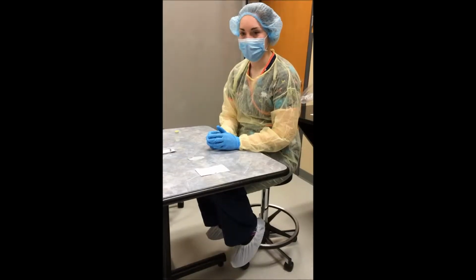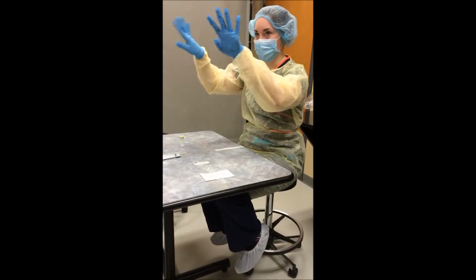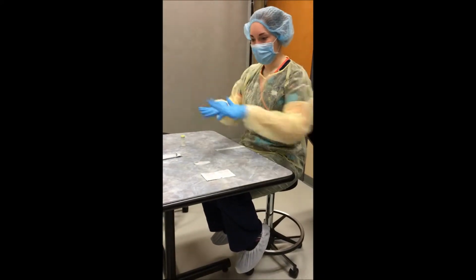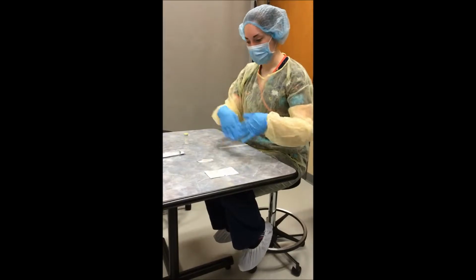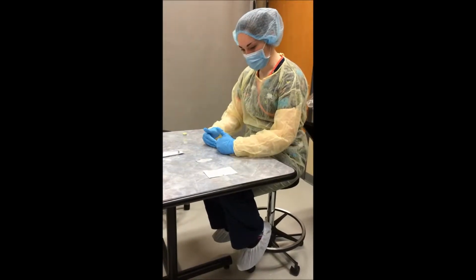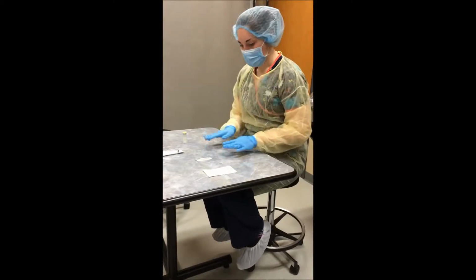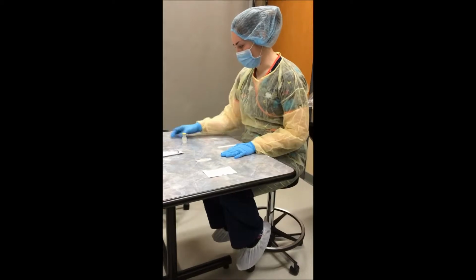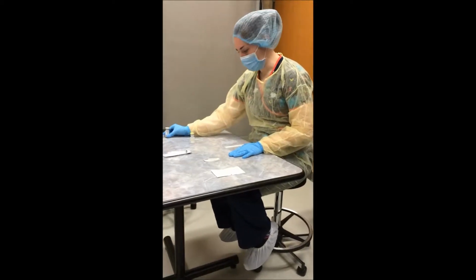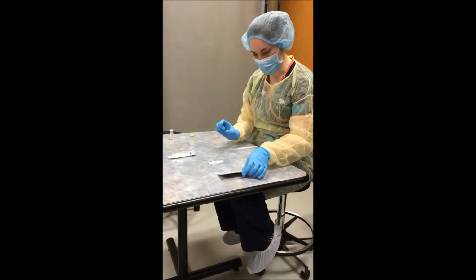So after properly garbing, you would come in and clean the hood from top, bar, side, and work area. You'd wipe everything down with alcohol before putting it in the hood and keep within 6 inches and make sure everything's 3 diameters apart and staggered. So from here, we're going to be reconstituting acyclovir with sodium chloride, 0.9%, sorry.